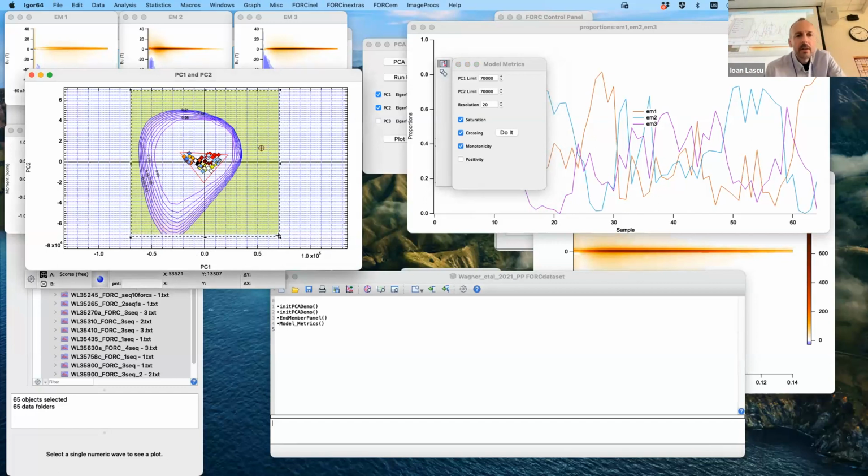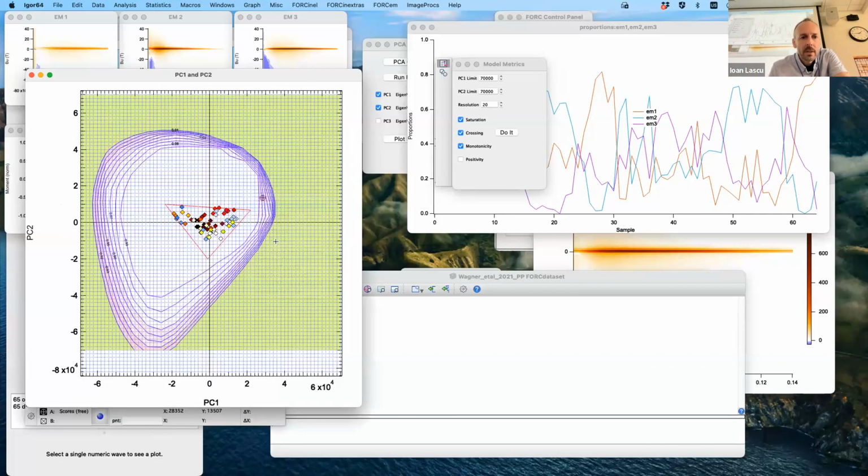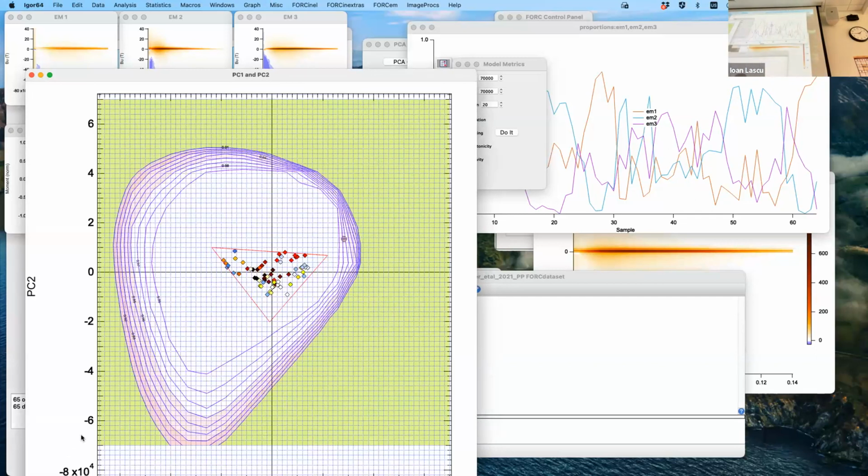Yeah, you want at least to have the whole data set within these. So you could go to 30,000. You want all your data to be in there. But in this case, the contours are way out there, so I wanted to have a bigger area to see. If you go to 80,000, you'll get coverage of this part too, but you don't actually need it.